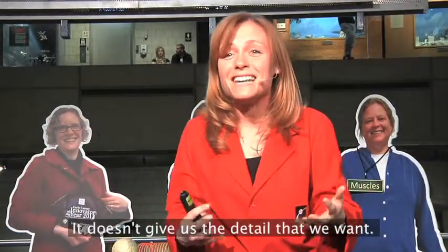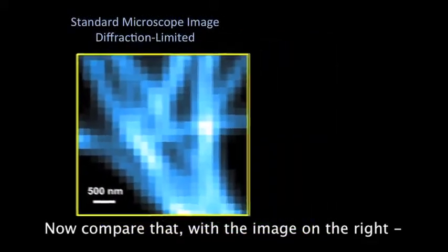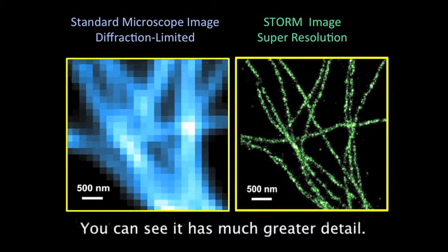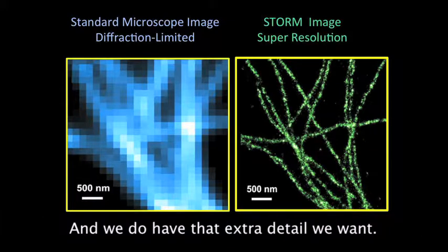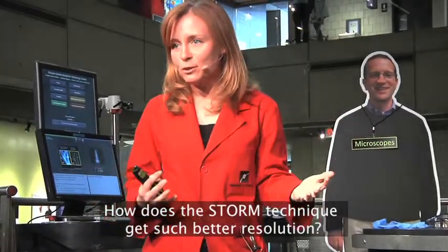It doesn't give us the detail that we want. Now compare that with the image on the right, taken with the STORM technique. You can see that it has much greater detail. Those are the same microtubules, this time in green, and we do have that extra detail that we want. How does the STORM technique get such better resolution?